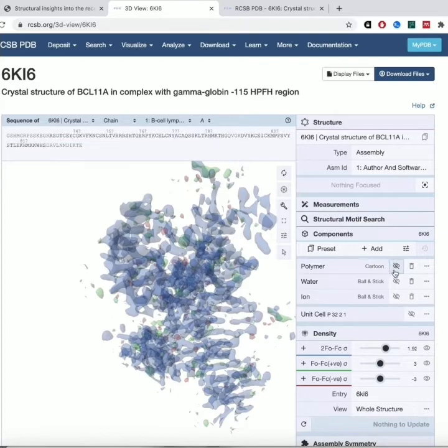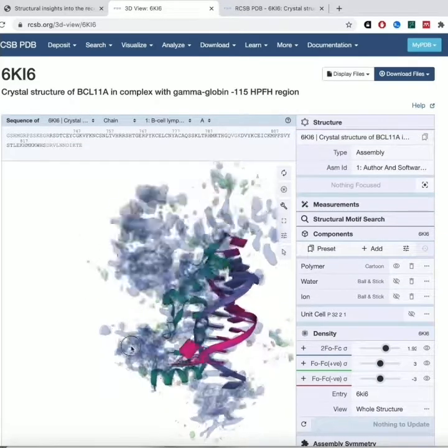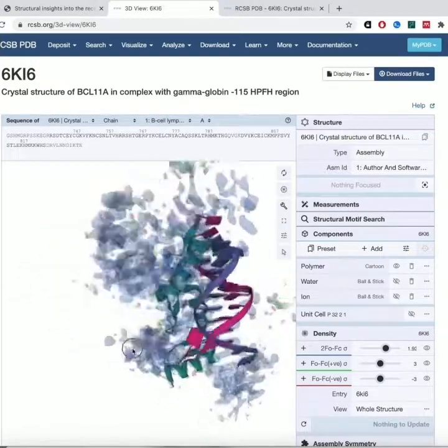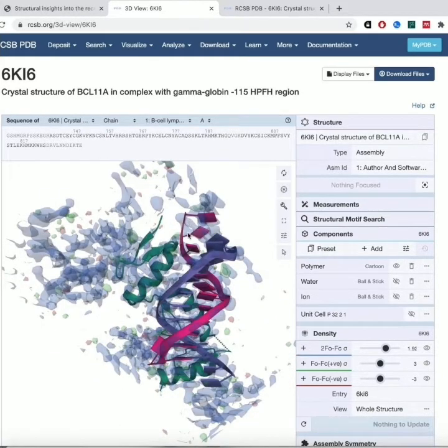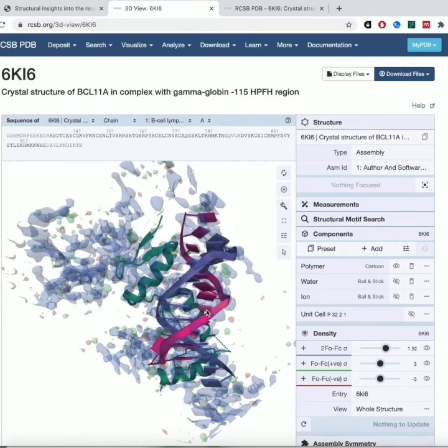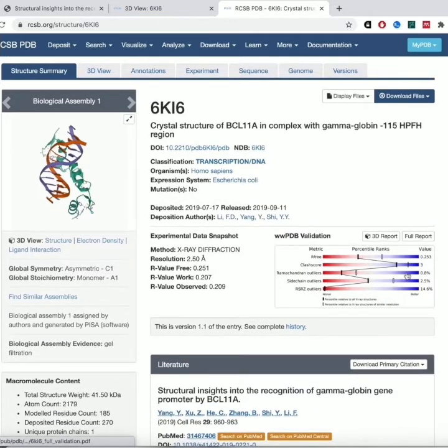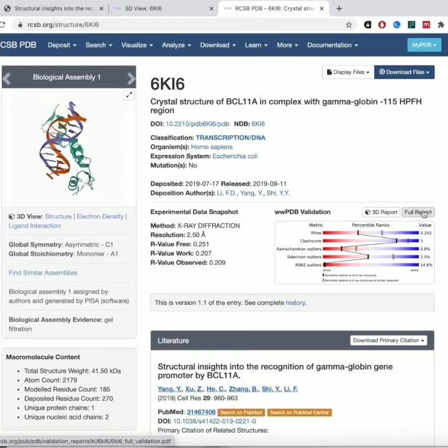Nowadays software will help you do it, and you can see that the model fits nicely in the electron density map. When you do this, you have to make sure that the model actually fits in the map. There are different values that we can use to assess how well the model fits the data, and also things we can use to talk about how good that data is, as well as how realistic the model is from a structural and biochemical standpoint. The PDB helps us understand these things through PDB validation sliders, and you can get a lot more information if you look at the full report.